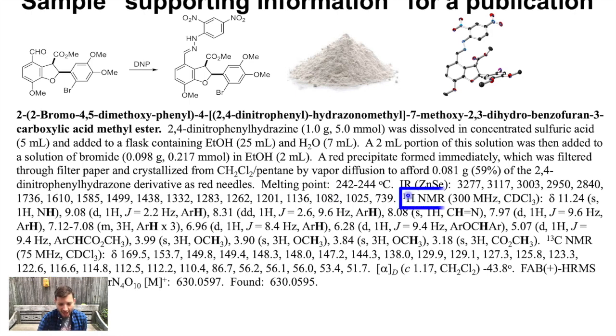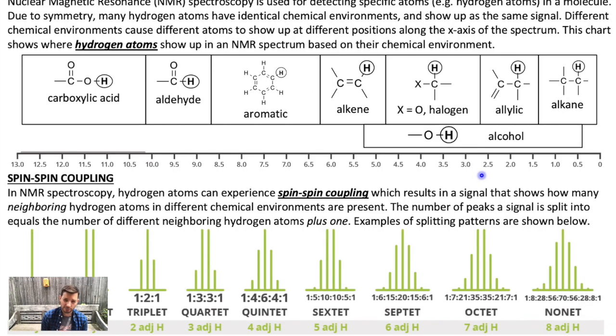So in addition to that, we took what's called an NMR spectrum. That stands for nuclear magnetic resonance. And that's the last thing we're going to talk about in this lesson today. Very, very introductory: how do we interpret an NMR spectrum of a molecule? So on your notes, there's a couple of paragraphs that talk about this.